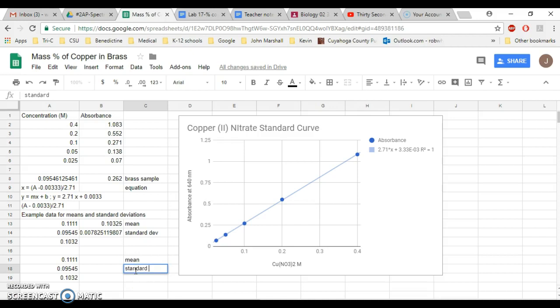And in fact, if you use the program, you don't really have to even know how to calculate mean and standard deviation, which is why when I teach it normally, I will actually make them calculate it first rather than just use this computer program, so that I'm sure that they understand what mean and standard deviation are. However, for the purposes of this, we don't need to know this. So the mean, as you know, is take these three numbers and divide by 3.